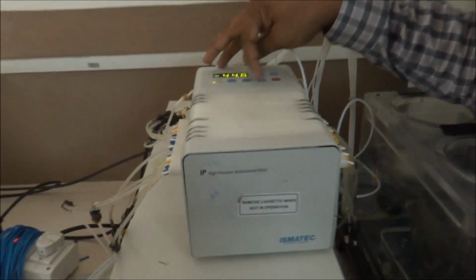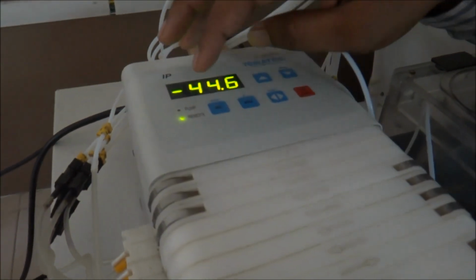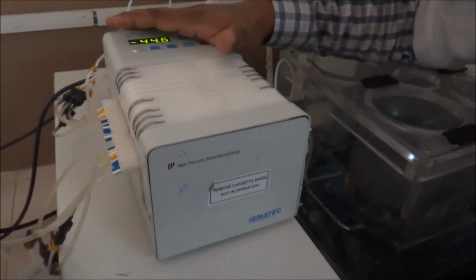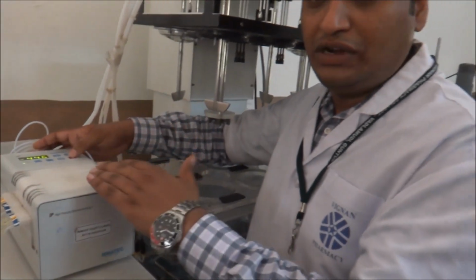So if you see here the panel board, you have got pump mode and remote mode. The remote mode says that now this pump is under the control of the CPU and you cannot directly operate or start or stop this instrument directly.